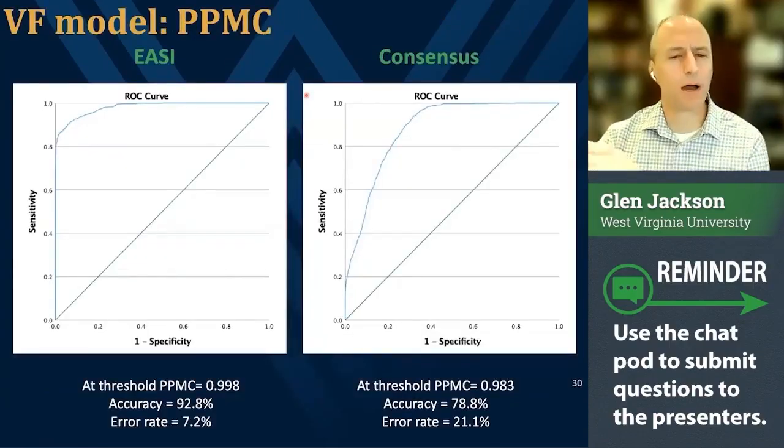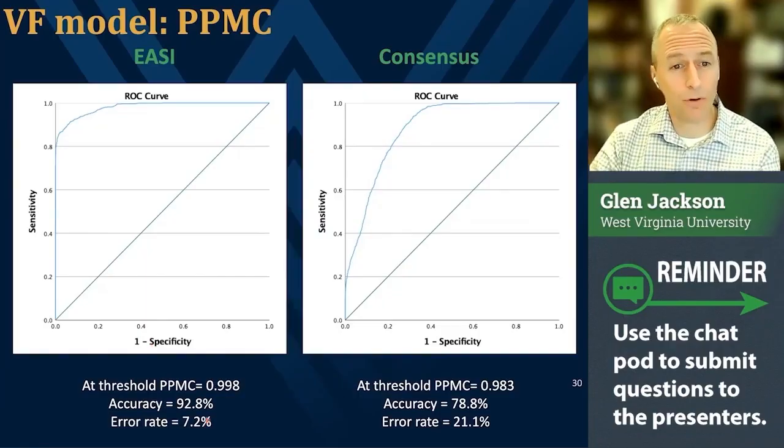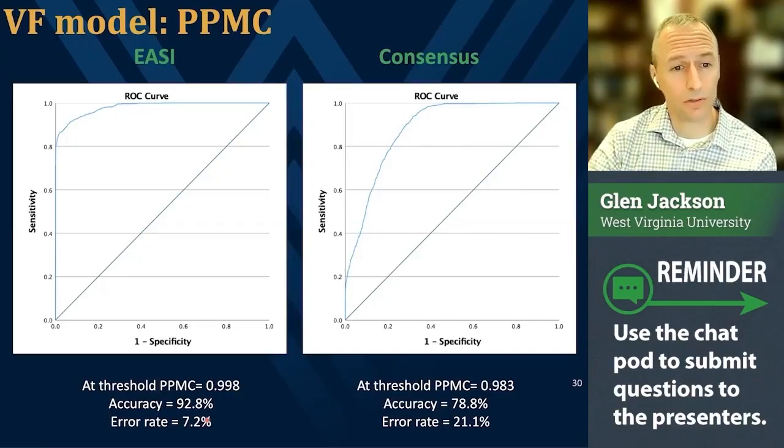We can convert this binary classification and assess it with the receiver operator characteristic curve or ROC curve. And you can see that in our case, we make about a 7% error rate for spectral identifications for valerofentanyl versus isovalerofentanyl, and that's without the GC chromatographic retention.